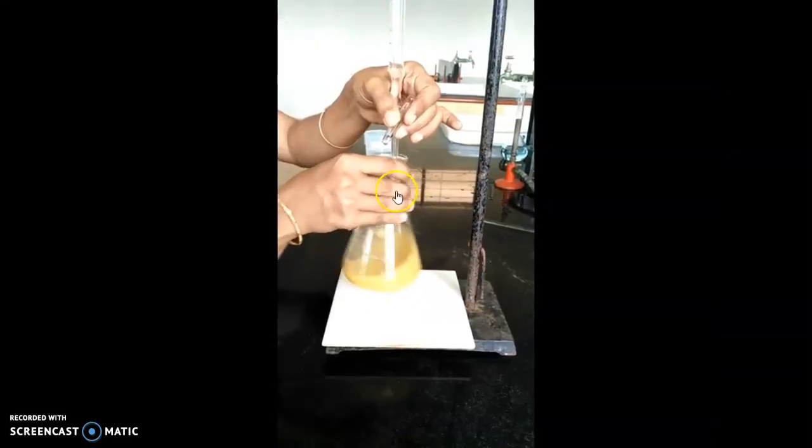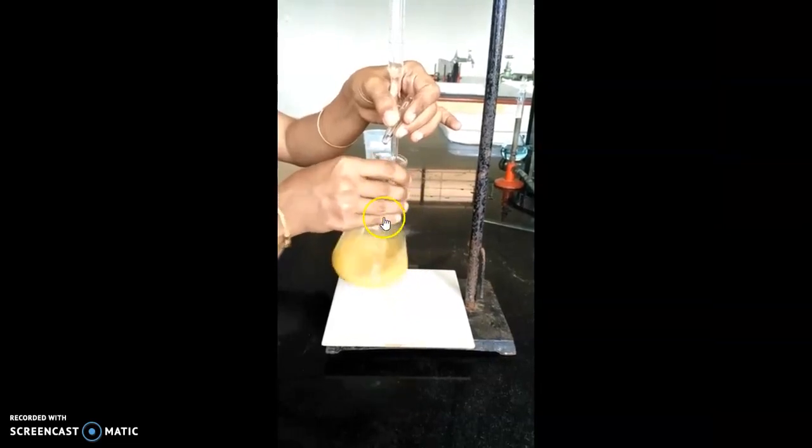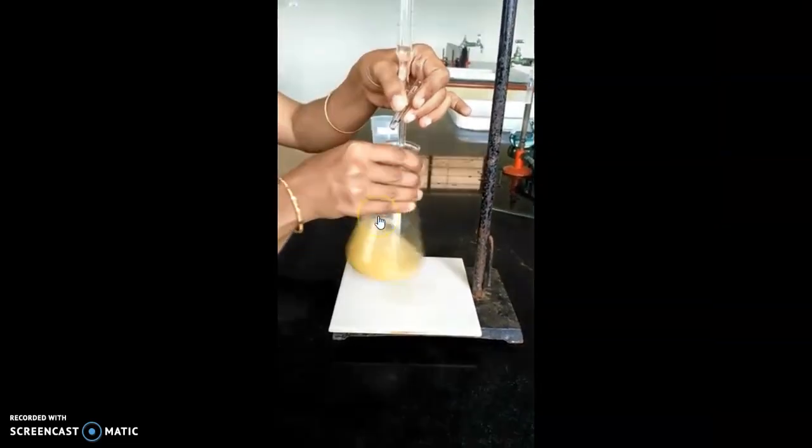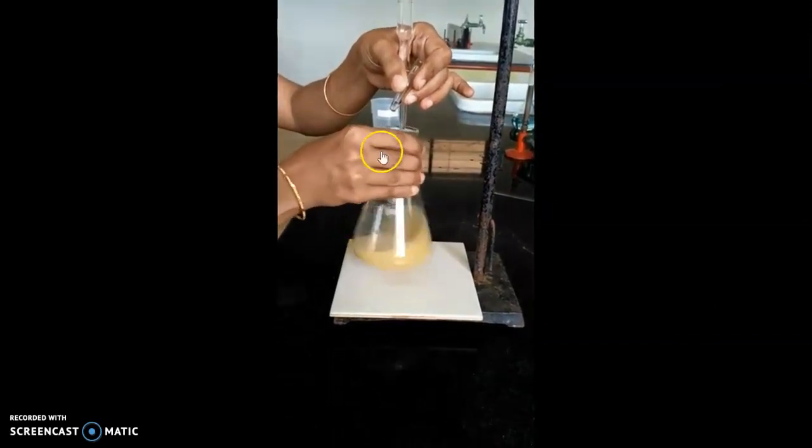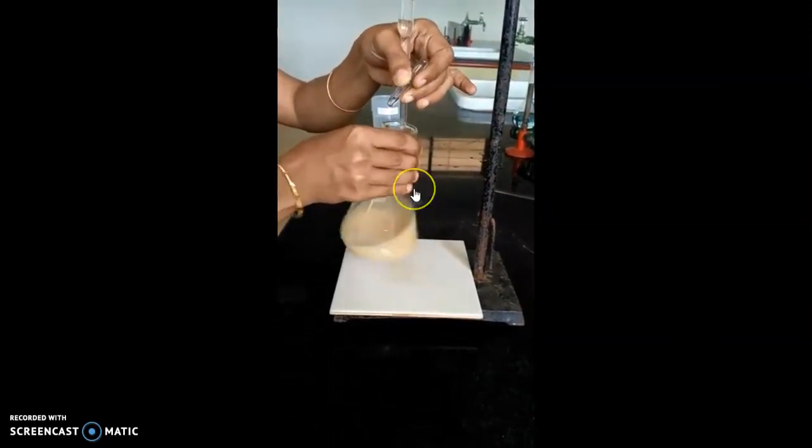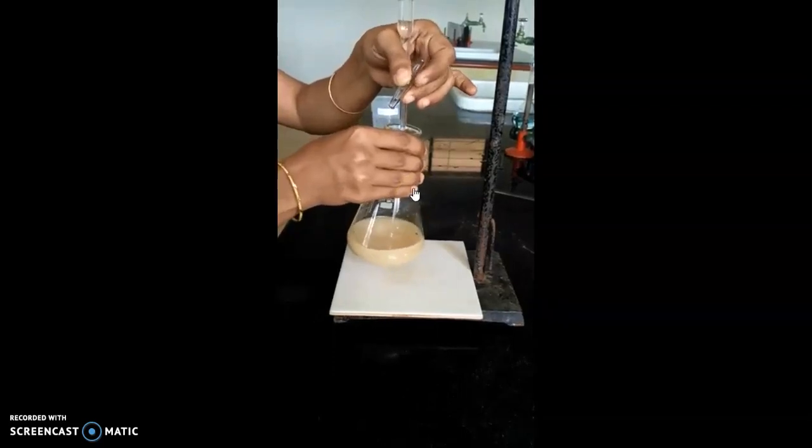And again, it has to be made to pale yellow. All the iodine will react with the hypo solution now, and pale yellow.